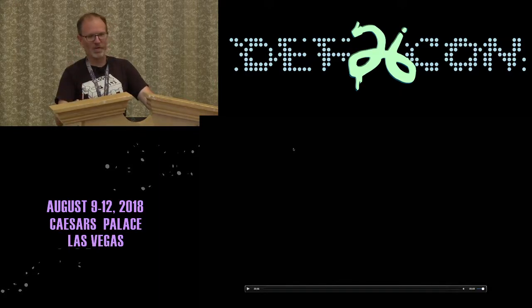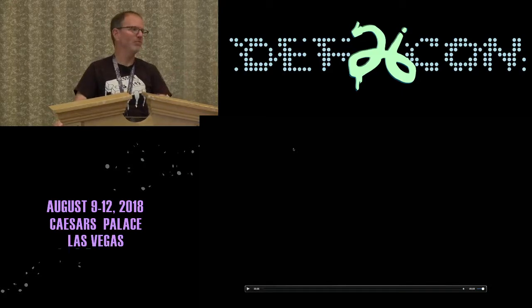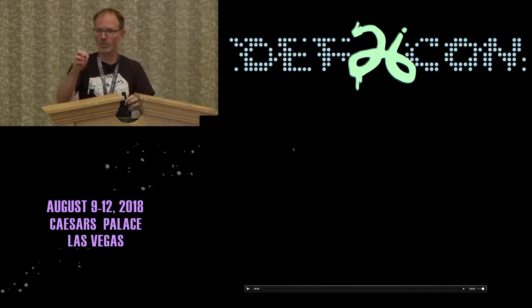The other thing you need to know about the OpenDrop platform is it's a synth. This guy Urs is really into synthesizers and theremins. So it actually plays the music of the Frogger game. And because he's able to get feedback on the droplet's position, he knows if he gets across the board or if he collides with one of the other things, because he knows where the blue droplets are and he knows where the green droplet is. So yeah, pretty tight stuff.